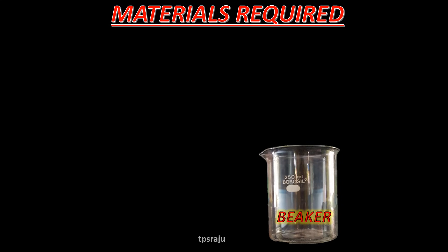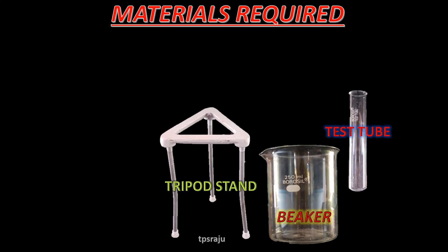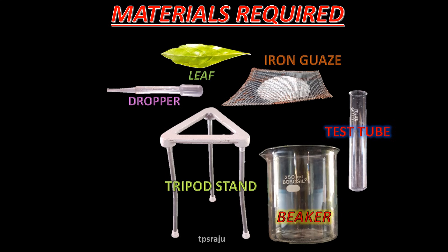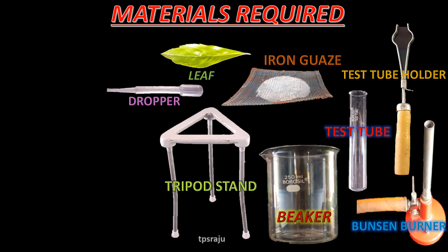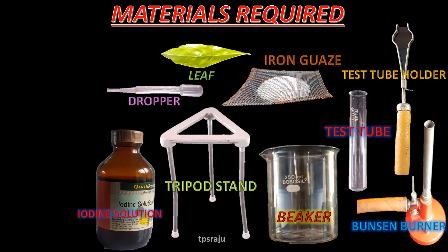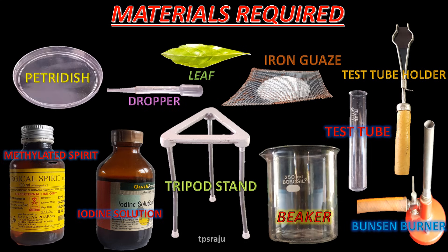For doing this activity, we need some materials such as beaker, test tube, tripod stand, iron gauge, dropper, leaf, test tube holder, Bunsen burner, iodine solution, methylated spirit and petri dish.